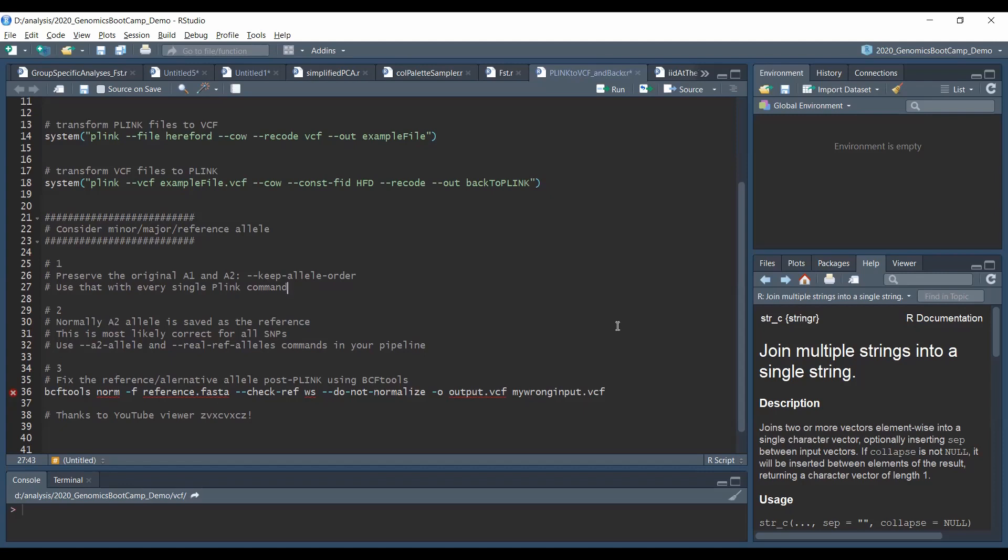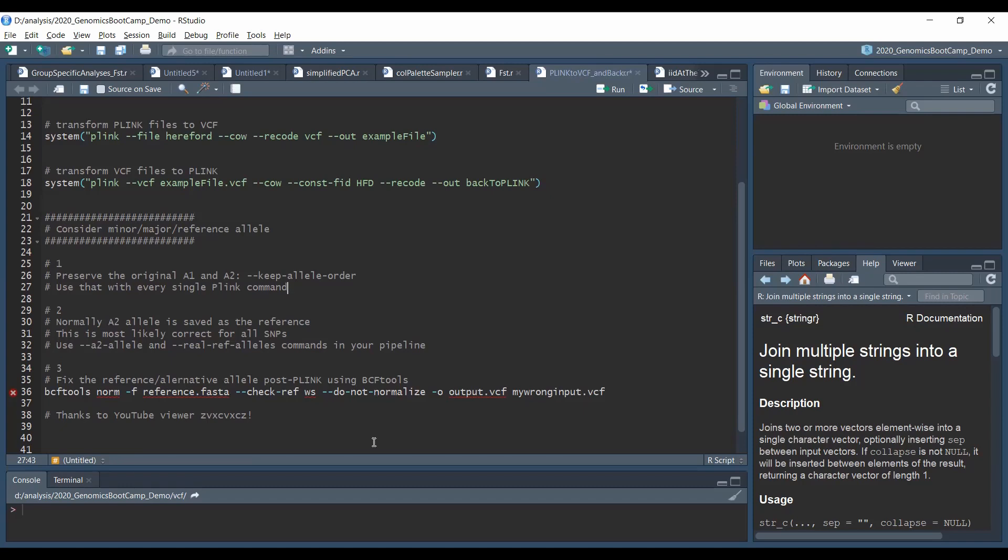Another possibility still within Plink is number two here. To use the A2-allele and the dash-dash real-reference-allele commands in your pipeline. And solution number three here, which I call post-Plink, is with another tool, the BCF tools. And this could fix the reference allele status by using the reference.fasta file. So this reference.fasta file is of course for your particular organism you are working with. So by running this line, line 36 here, should fix the reference and alternative allele status for your organism even if this would be messed up in Plink previously. Thanks to YouTube viewer ZVXCVXCZ for pointing these things out.